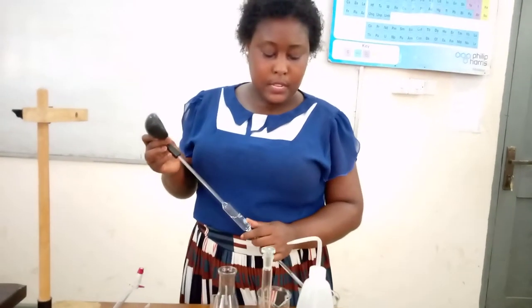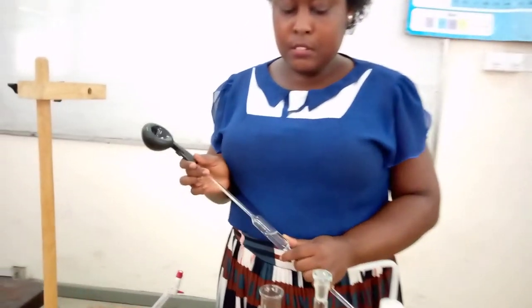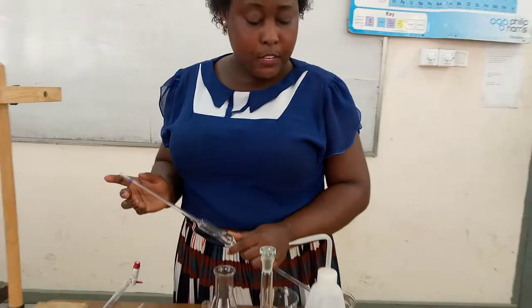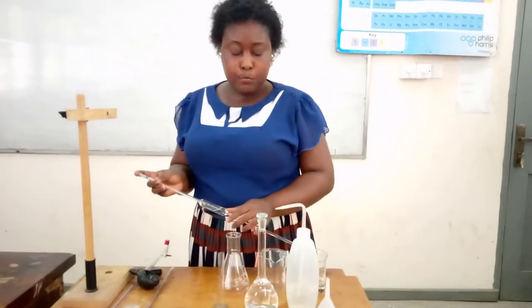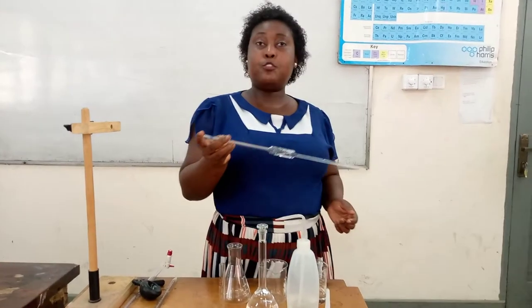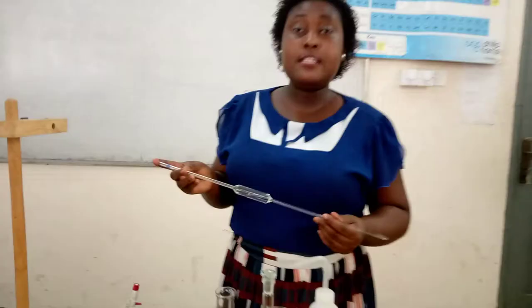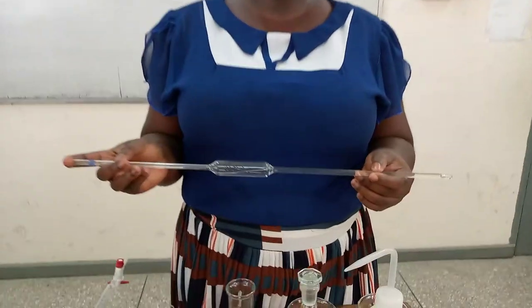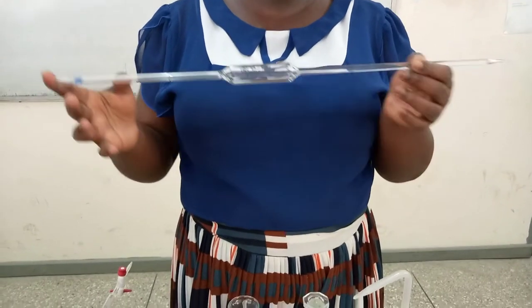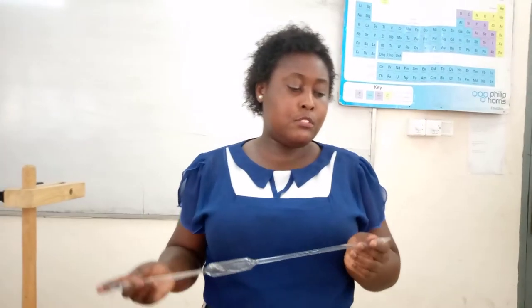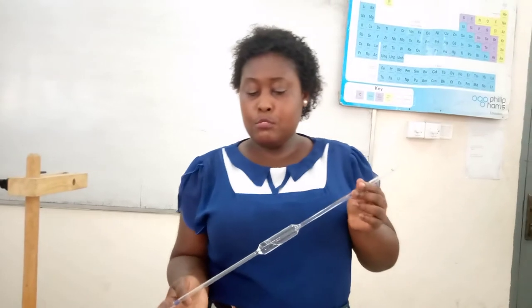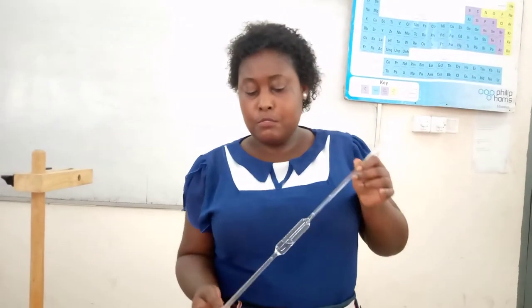So I think this is okay. I will take the bulb off — when you take it off, the water will start coming out, so you have to block it with your forefinger. This is how you rinse the pipette with distilled water. You have to hold the pipette in a horizontal position, then you move the water in it like this. If you turn it upright, the water will fall. So you rinse it like this with distilled water.